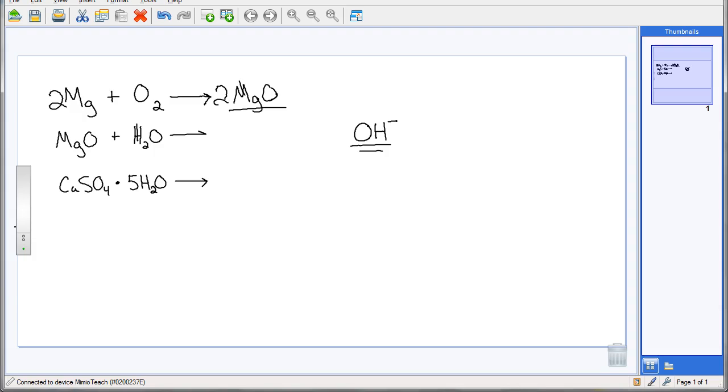So that might have been a good hint for you that this crystal that was originally one big piece has broken apart into the copper sulfate compound, which is the white crystal, and then separate from that is the water. Okay, so I really did that one for you. It broke apart into 2 pieces, so it was a single piece. Now it is in 2 pieces. Okay, that is a definition of decomposition. You're breaking it down into smaller pieces.